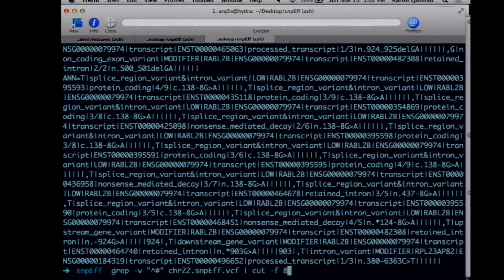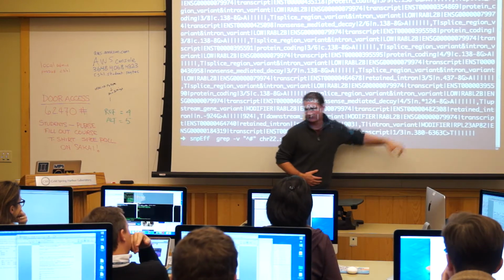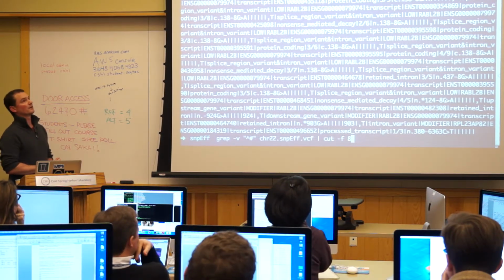One thing we're going to want to do is pull out the HGNC gene ID. I think it's right after the modifier. Oh, it is? So above, when you were looking at it, that AP whatever was the Vega gene. For whatever reason, they used the Vega annotation. So the question is, effectively the same problem: how do we pull out just this bit from every record, especially when every record has gene information in it multiple times? I've got to think about that for a second.